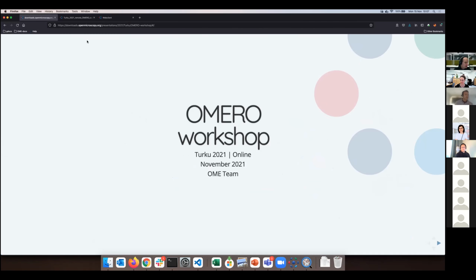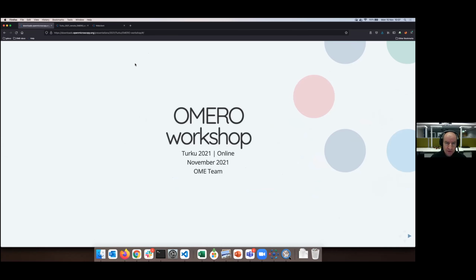So welcome again to the OMERO workshop in Turku. And we start with a short presentation. As we just said, for those who came late, we will go straight for an hour until 1 p.m. Then there will be a 15-minute break. And in that time, we will mainly concentrate on the first part of the workshop.